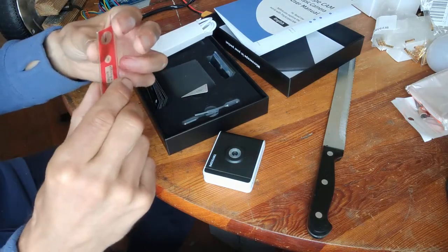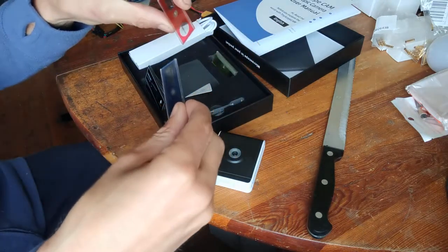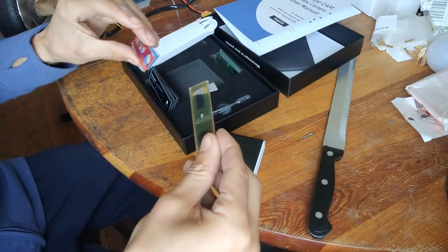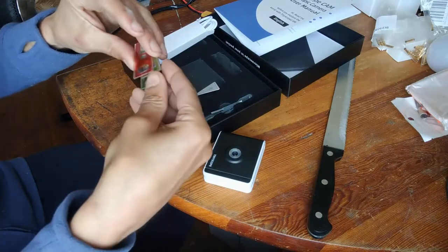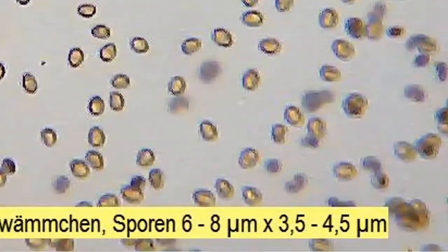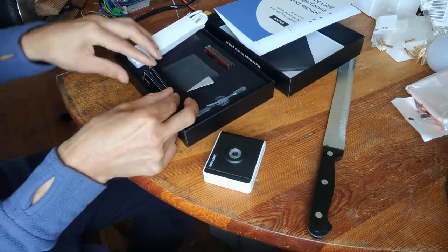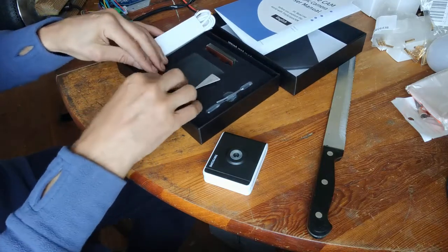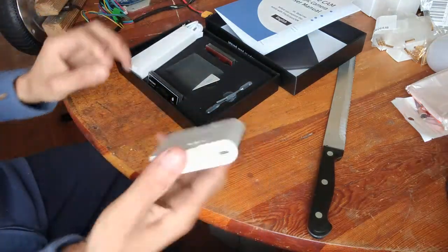There are some samples you can instantly try — plankton and a dragonfly wing, which is great for education and for kids. There's also pollen, fungi, and mushrooms. I'd love to use this to help identify mushrooms out in the forest. It was really quite cheap for something that could be more than just a toy.